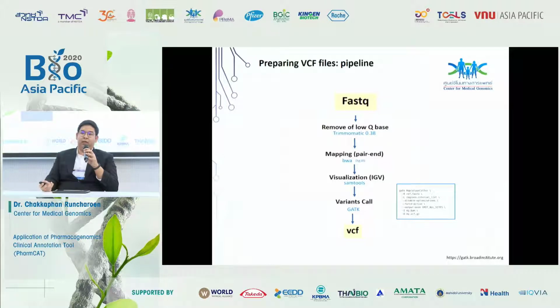For this work, I used the HaplotypeCaller with a few arguments, including the force active, the disable optimization, and the emit all sites.